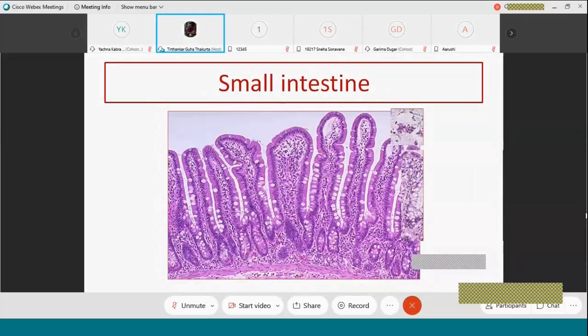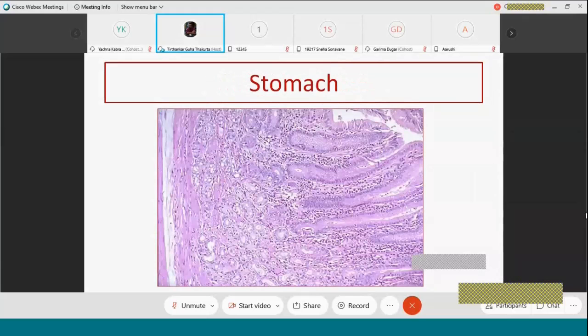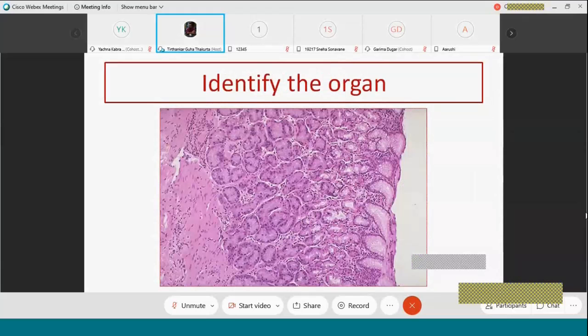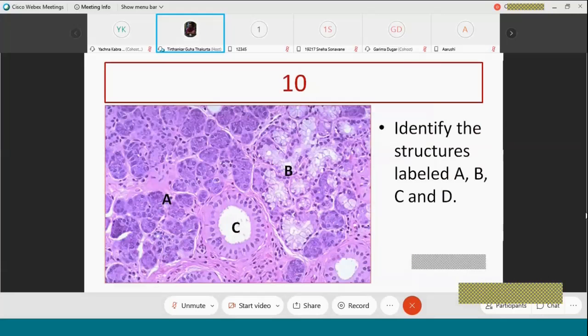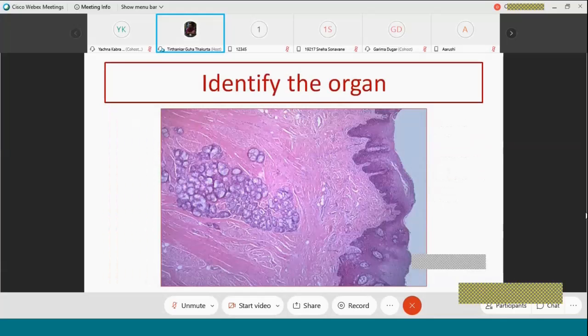And you keep on looking at the images again and again from various perspectives, from various images at the low power magnification. One big mistake that I have seen students do often is that they think that identification will be easier in higher power. That is not the case. If you look at the mountain from a long distance, you can look at it and name the mountain. You can say whether it is Mount Everest or whether it is Kanchenjunga.